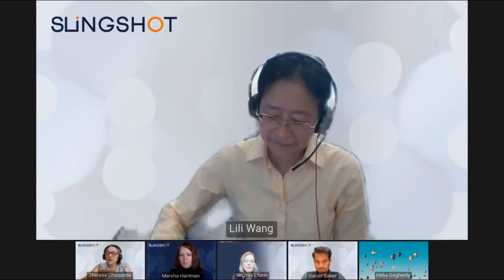So if I can jump in then. That's how I came to use it, because I found it really instructive. So the other guideline tells you that you have to do accuracy, and then we go into quite a bit of detail on how you can do that in flow cytometry. And the same for limits of detection and limits of quantitation, which are addressed differently. So this is how you address it, but maybe the ICH guideline is telling you what you need to address.